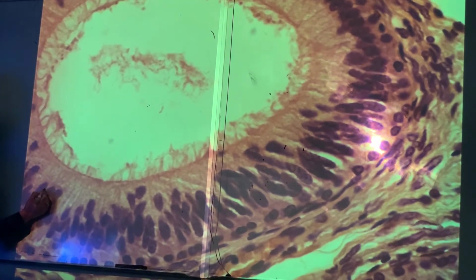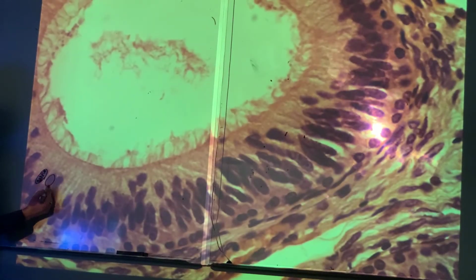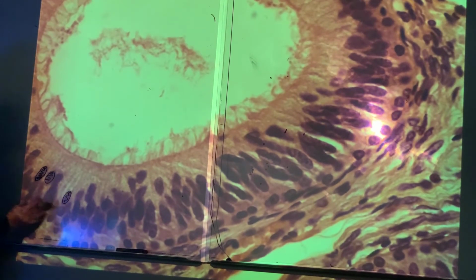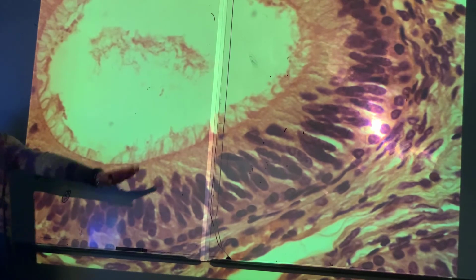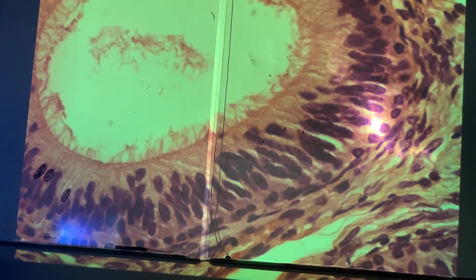now we can very clearly see we've got purple nuclei. Nice, solid stained purple nuclei. And again, lots of purple nuclei. They're not all in one perfect layer because this is pseudostratified columnar epithelium.